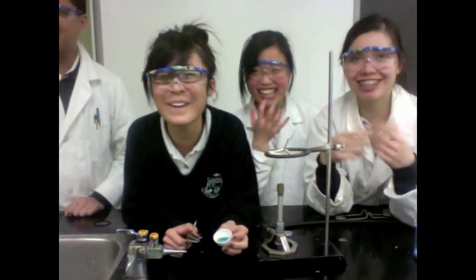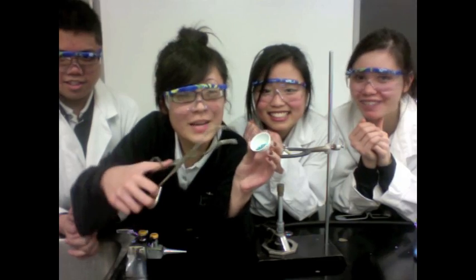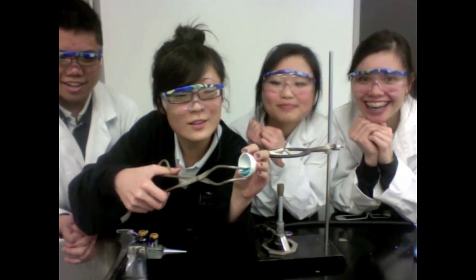We're making a hydrate cookie — this is a secret! Now that the crucible has cooled down, you can remove the contents using tongs. Look what I made — you can remove it and it's called a hydrate cookie!